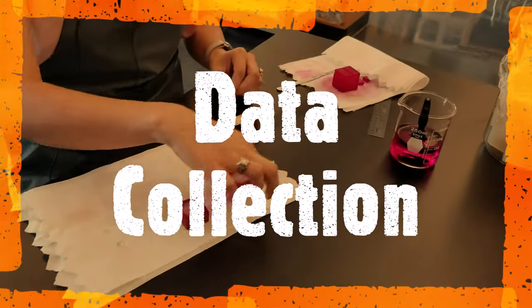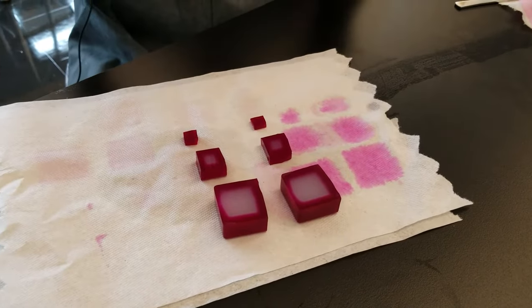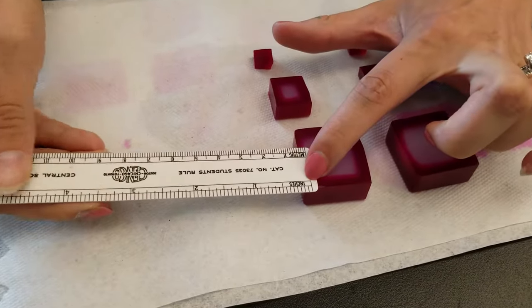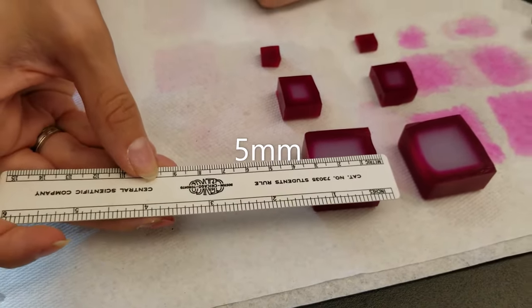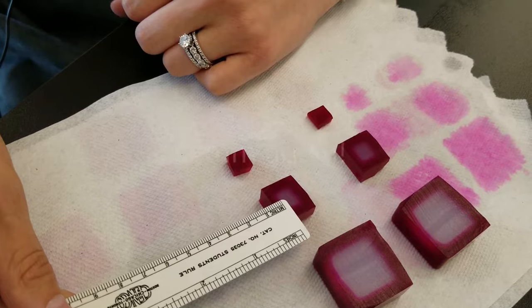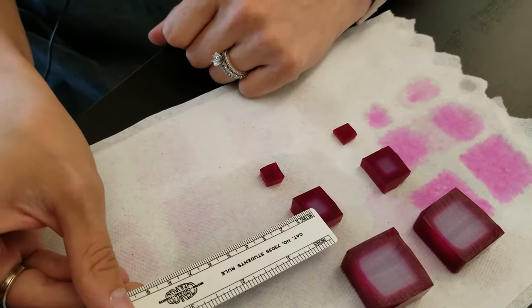There's nice magenta color on the outsides of the cube and white in the center. This tells us that the nutrients were able to get into the cell. We're going to measure in millimeters how far the nutrients came in. Measuring on the metric scale, it is about five millimeters into the cell — and that's the same no matter which side of the cube. If I go to the smaller cube, it is also five millimeters — or 0.5 centimeters — into the cell. It looks like a little smaller white center, but that's just because the cubes are different sizes.